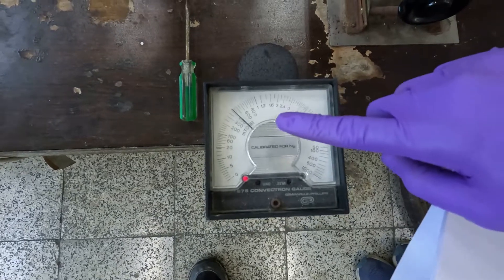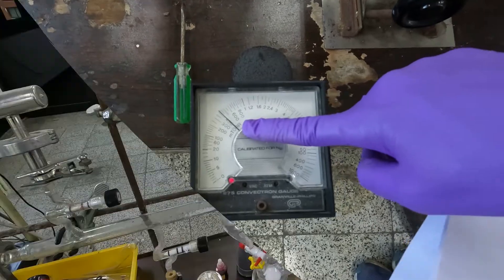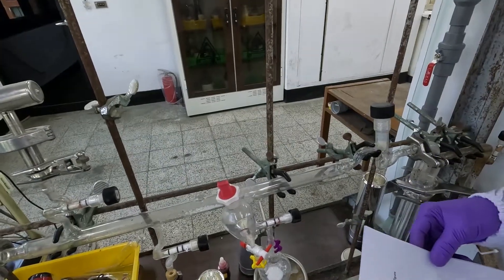Observe the pressure on the gauge — it should be below 600 mTorr. The next step is to open valve B.